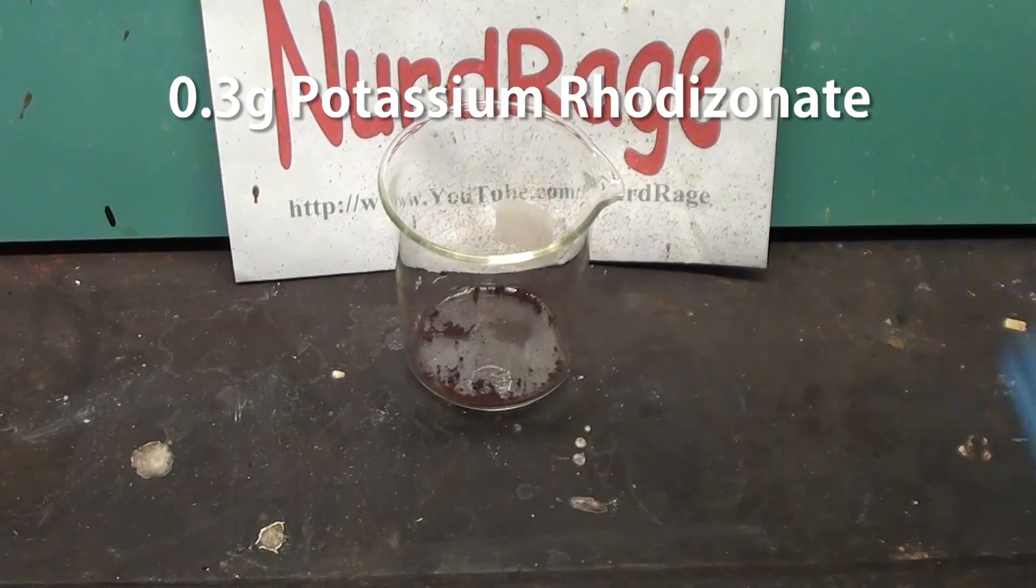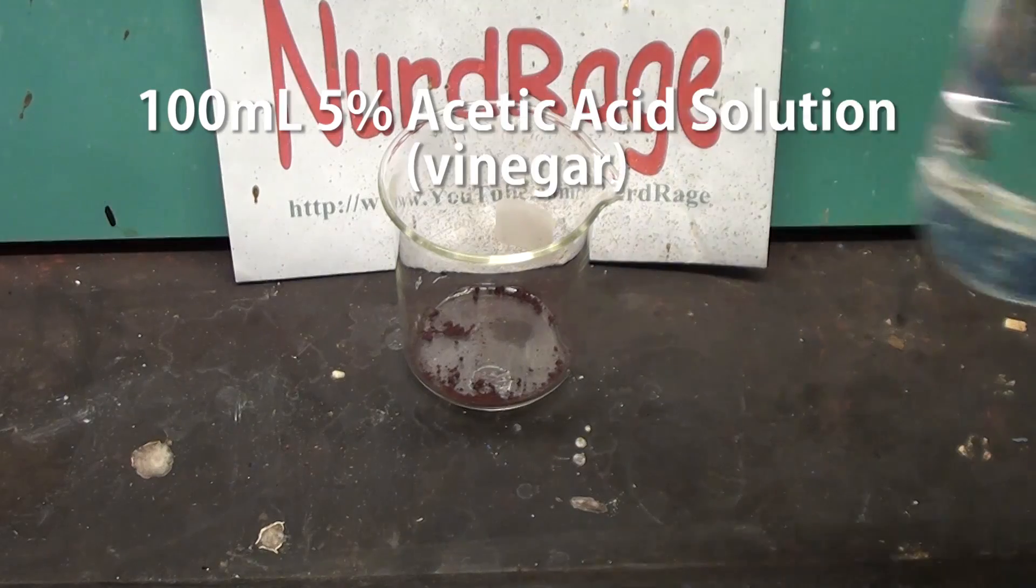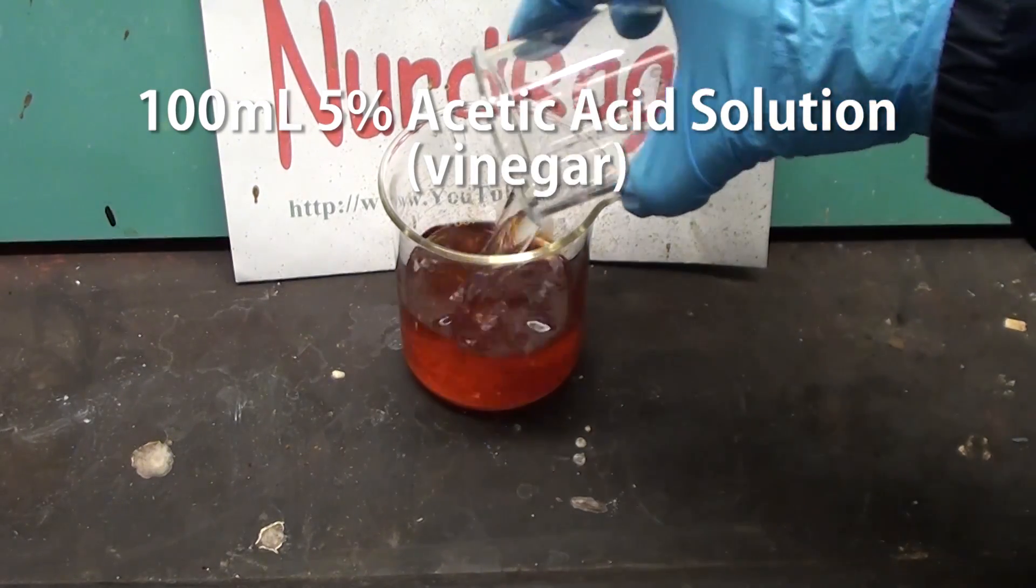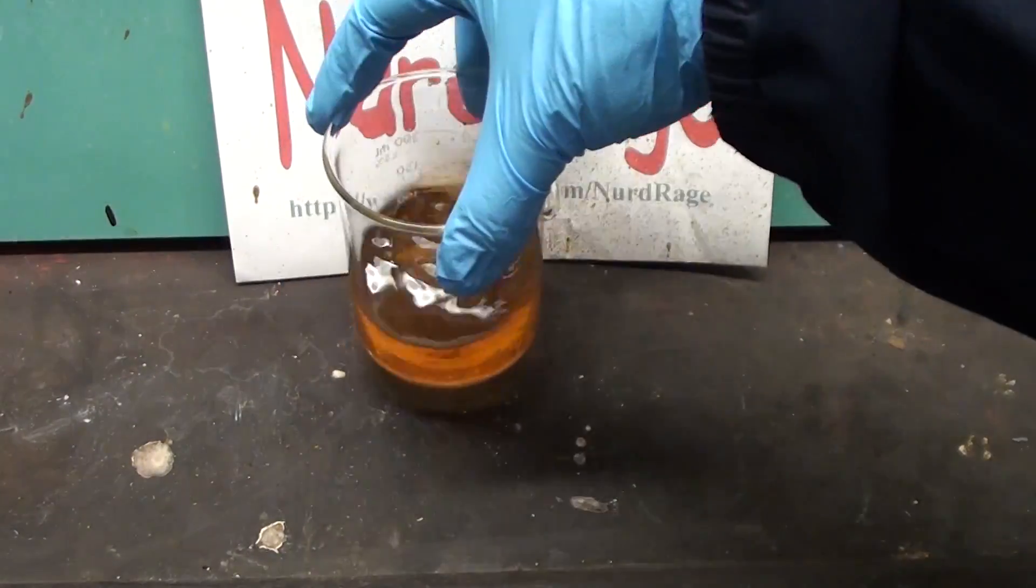First get about 0.3g of potassium rhodosinate and add to it 100mL of 5% acetic acid solution, also known as vinegar. Try and dissolve as much as you can.